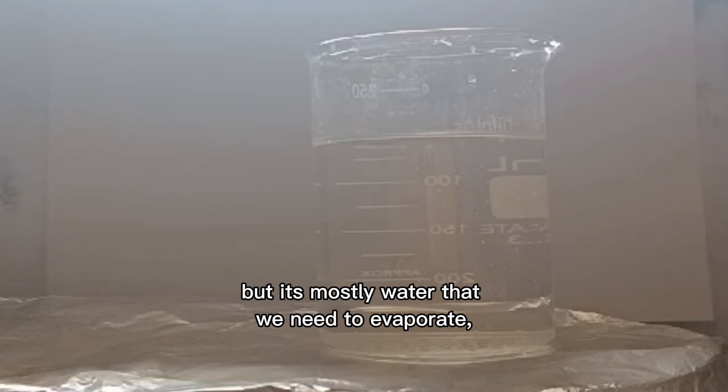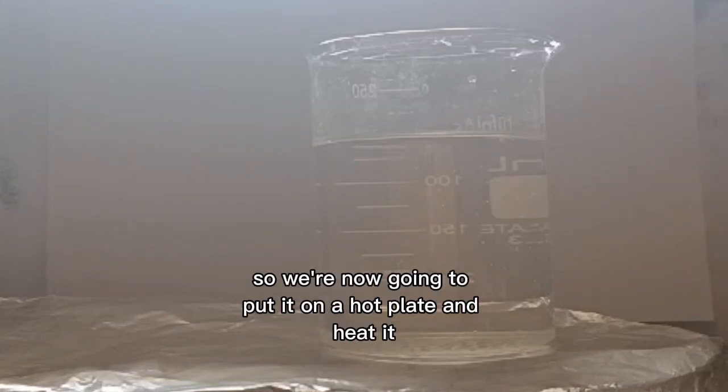But it's mostly water that we need to evaporate, so we're now going to put it on a hot plate and heat it.